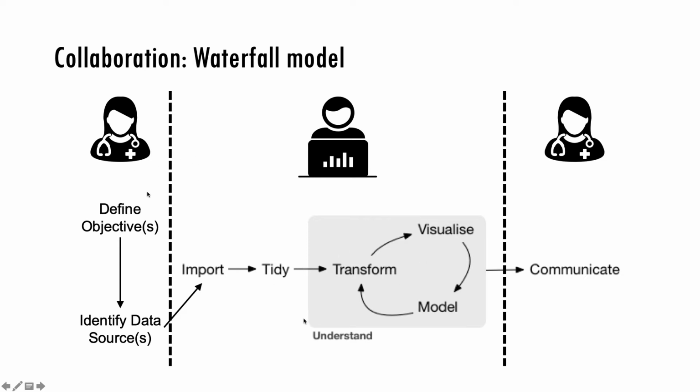So for example, let's say this is a lab director who asks a staff member to compose an audit of last year's transfusion reactions. Maybe the lab director will send the technologist a list of patients who've had a transfusion reaction with dates, and then the tech will do some data cleanup and manually look up each patient from the EHR and pull out the data that they think are needed for the audit.